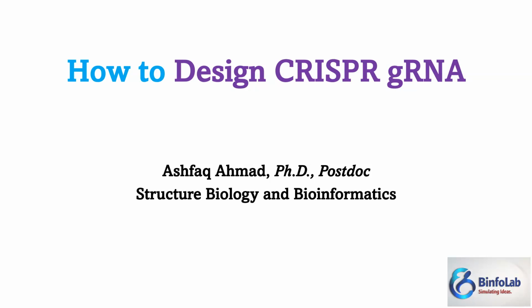Hello everyone, my name is Ashfaq Ahmed and I work in the field of structural biology and bioinformatics. Today I will talk about the basics of CRISPR, and we will also learn how to design guide RNA, or gRNA, in a CRISPR experiment.